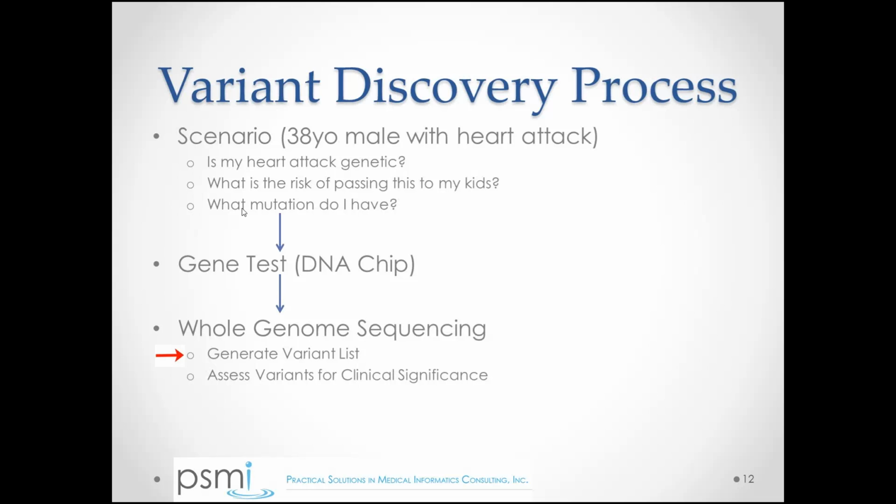And so really, what this class is devoted to is whole genome sequencing. And we're going to walk through the process now of applying whole genome sequencing to this particular patient. Really what we're trying to do is figure out in this particular case what mutation is responsible for this patient's familial hypercholesterolemia. And I broke this whole genome sequencing down really into 2 steps.